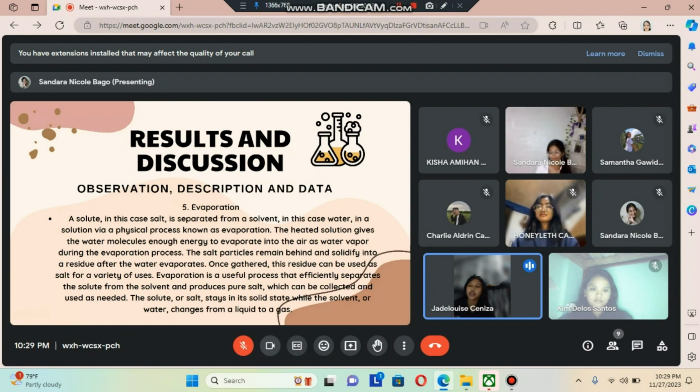There are several uses for this residue as salt. Pure salt is produced through effective separation of the solute and solvent by evaporation, which may be collected and used as needed. So let's proceed to the guide questions.